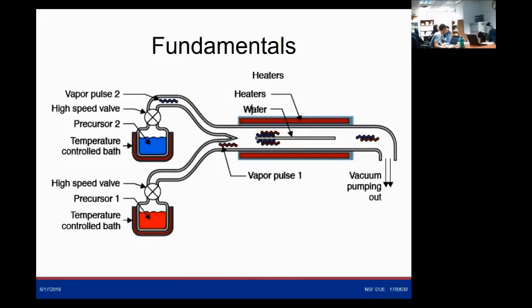So it's very similar, as you can see, to CVD methods. You have a furnace kind of thing, like a heater that will increase the temperature and enable the chemistry. You will send the material from these two precursors, as you can see. They should be very reactive. And then they start the reaction, but you send each precursor one at a time, single.